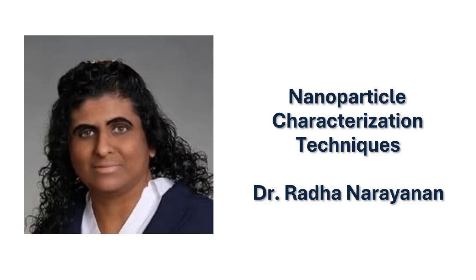In this module, we will discuss the different characterization methods that are used to visualize the nanomaterials that are between 1 to 100 nanometers in length.